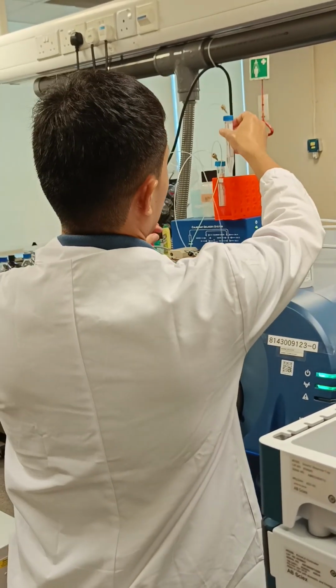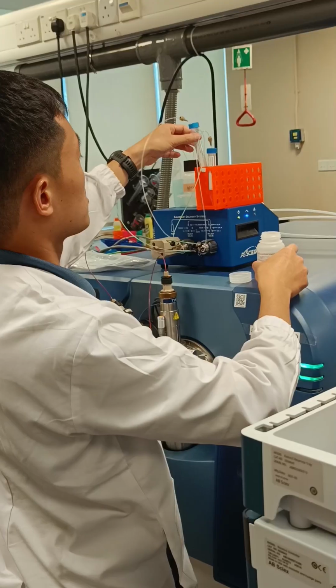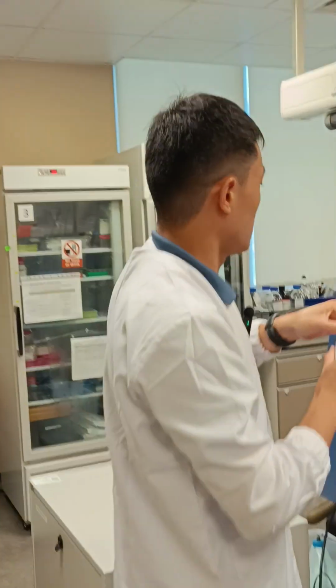Yeah, it's APCI negative. If you want to run positive, it will be here. This one will be the positive one. Yes, it's in the fridge.